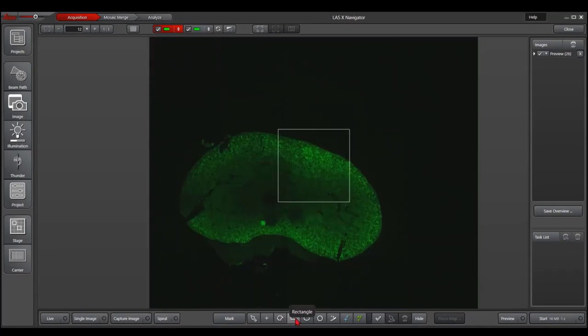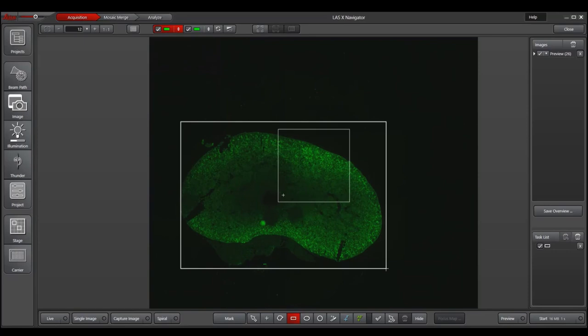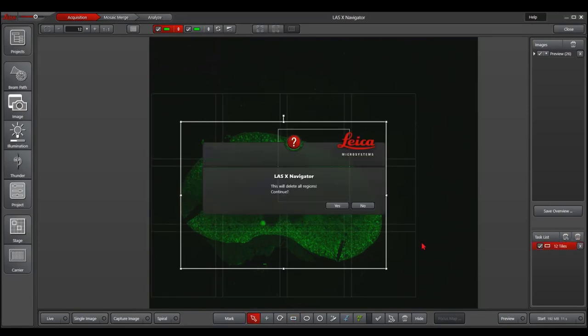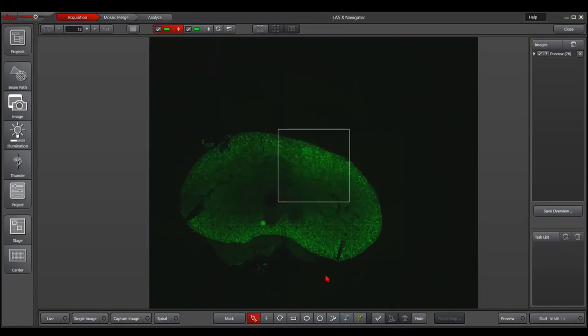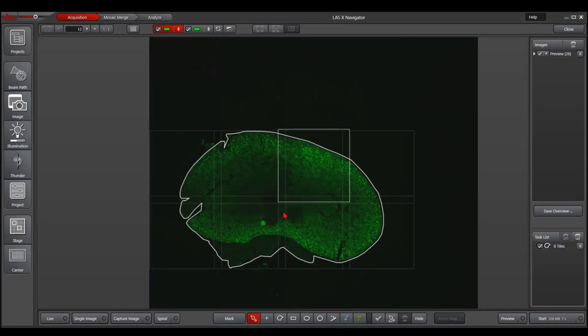Then either draw the shapes around the sample you want to capture, or you do the magic wand to select the object.